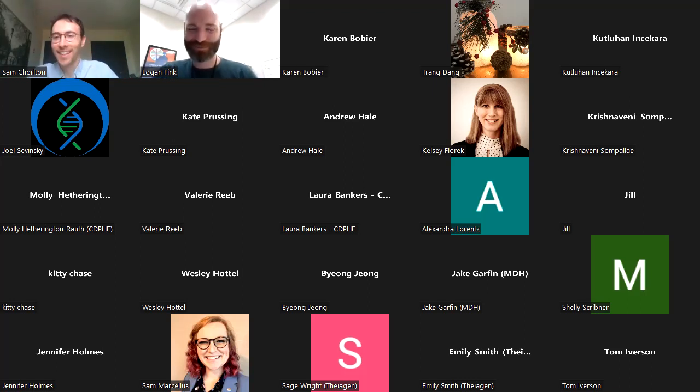Cool. And then in terms of any plans to include plasmids, mobile genetic elements in the ref MLST method in the future, there are examples where whole core genome MLST doesn't work well due to clonality of certain organisms and serotypes. Sounds like a really cool approach. Thanks for sharing. That's a great idea. I don't think we had directly considered that yet. To be honest, the MOB-suite method I'd highly recommend if you're looking at plasmid typing is quite effective at having unique taxonomic identifiers for plasmids. However, if you do need a more nuanced or tailored approach for plasmids, yes, I suppose looking at their gene content and comparing that across plasmids would be an interesting way to do that.